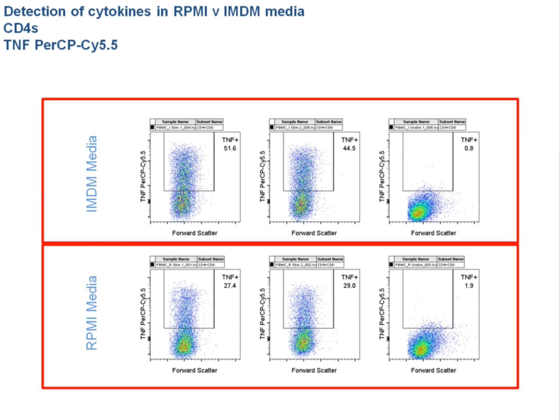Okay, thank you. Another question is, can ICS be used in the case of developing T cells, as in the double negative stage of T cell differentiation? Sorry, say that one more time. Can ICS be used in the case of developing T cells, as in the double negative stage of T cell differentiation? Well, you're not going to use it for developing the cells.